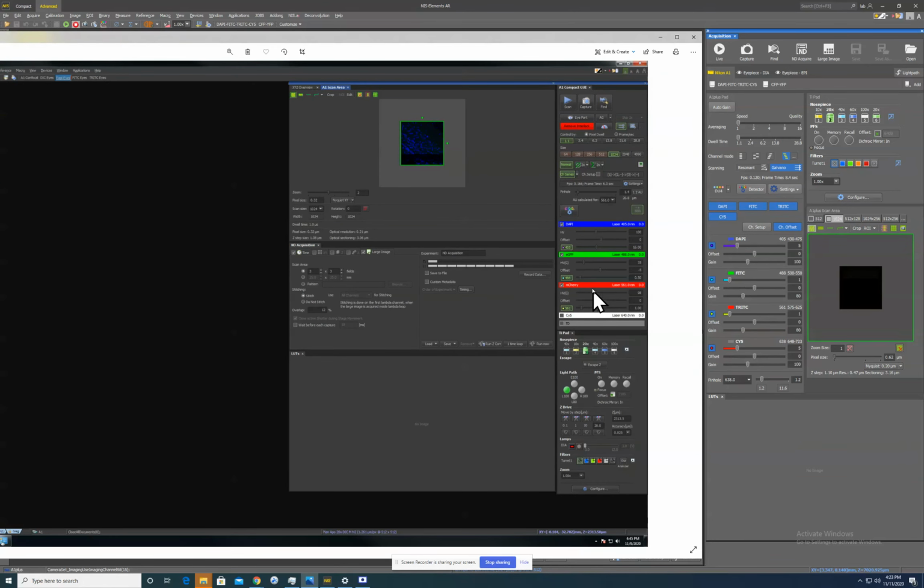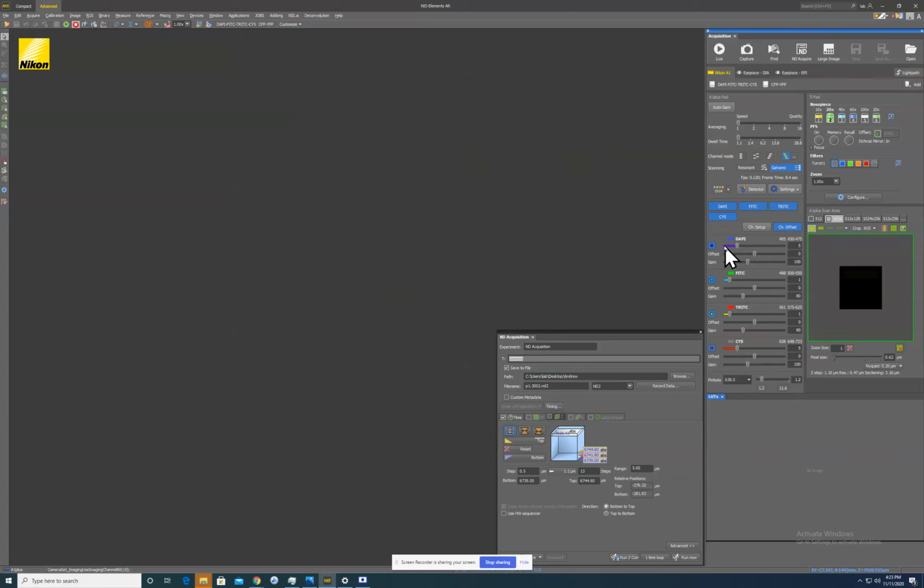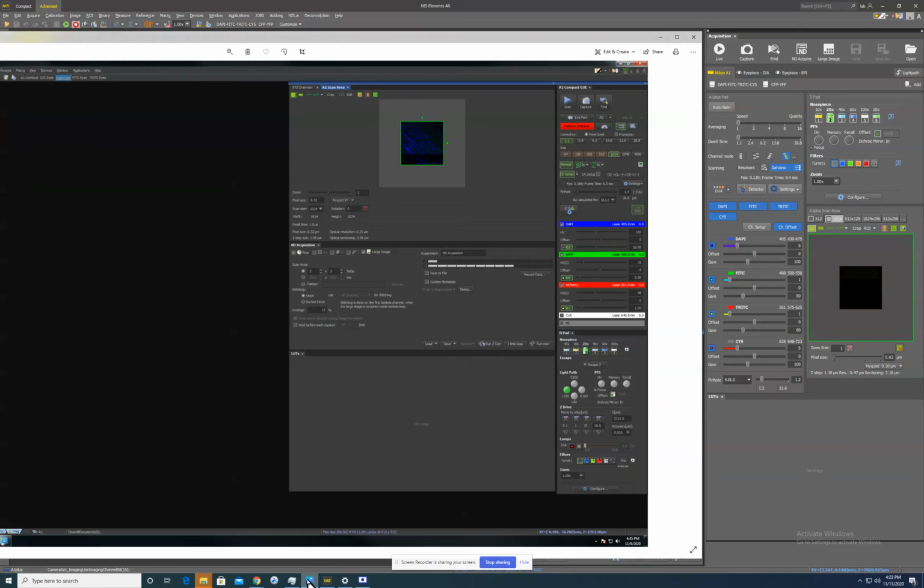In the previous setup, you had HV, offset, and then your laser percentage. In your new version, that's actually upside down. So you have your laser percentage, offset, and HV is on the bottom. It's now called gain. It works exactly the same. It's just inversed. Let's see, you have your nose piece here. Works exactly the same. It's just now up here. All of this stuff that you probably ignored is still here. It's just also up here.